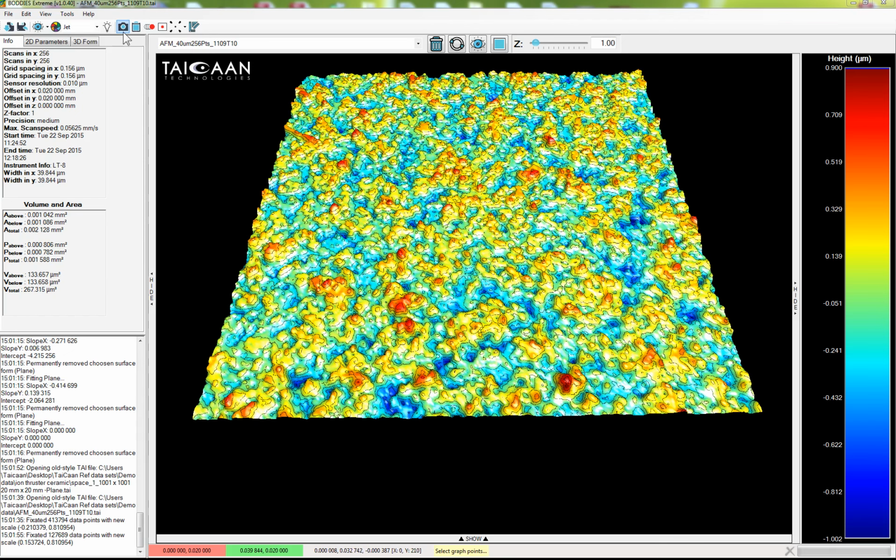Let's start this by looking at the icons in the top left here, which I'm pointing to. The first one we see is a camera. If I click the camera, that will take a bitmap image of the image space and the color scale and allow me to save that to particular locations. The one that I use most often is the clipboard. So by simply clicking the clipboard here, I'm going to take the same information.